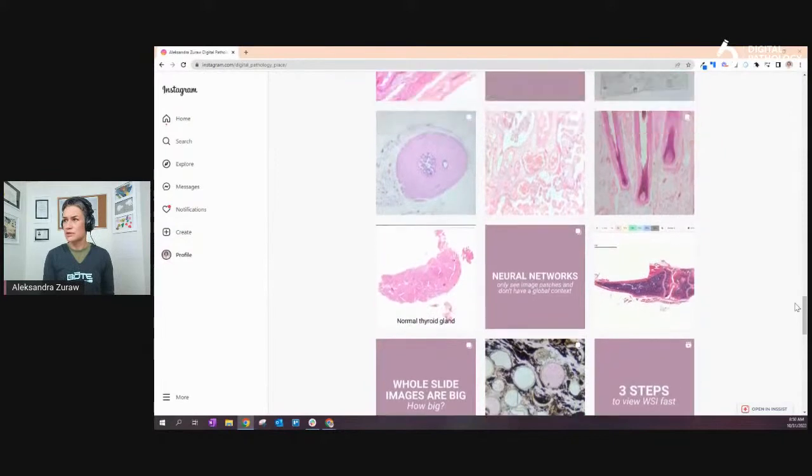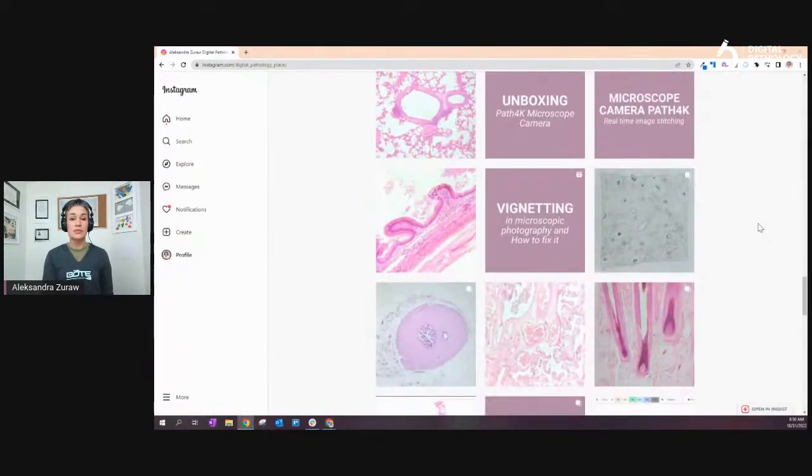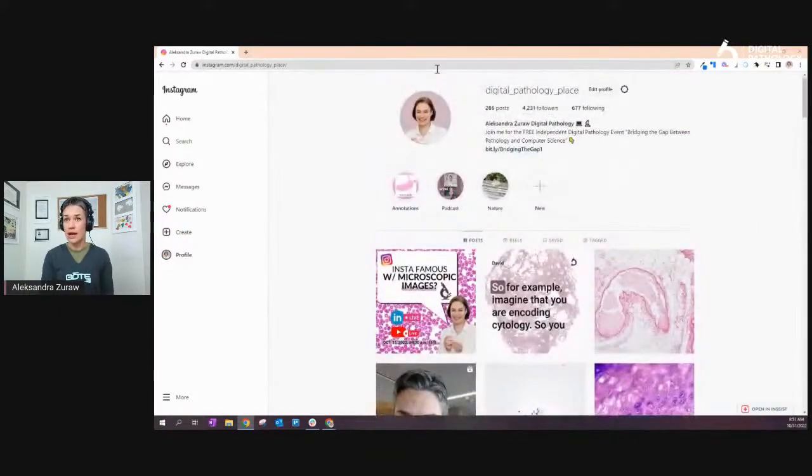I'm looking for something. Here white is not so white. This is whiter. This is so. But basically, the purpose of white balance is that white is white.